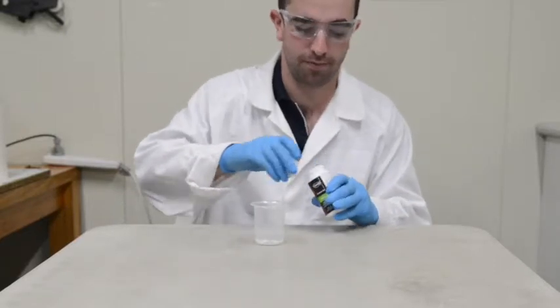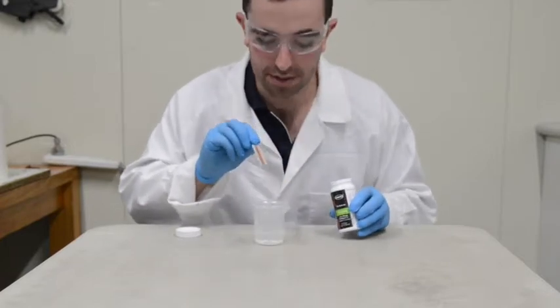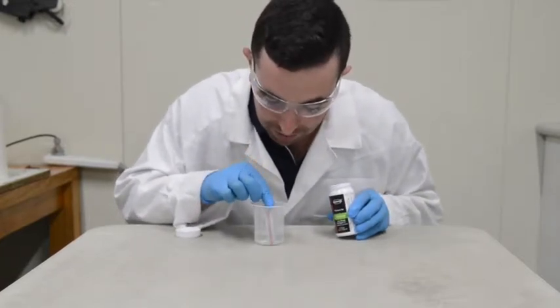First I'll remove the lid, grab your test strip, place in your sample water with the numbers at the bottom, making sure you do not go above the yellow line.